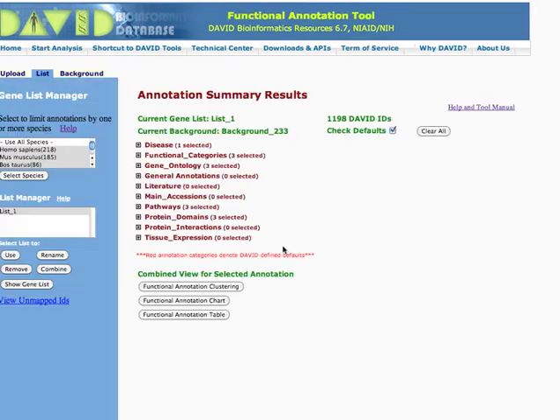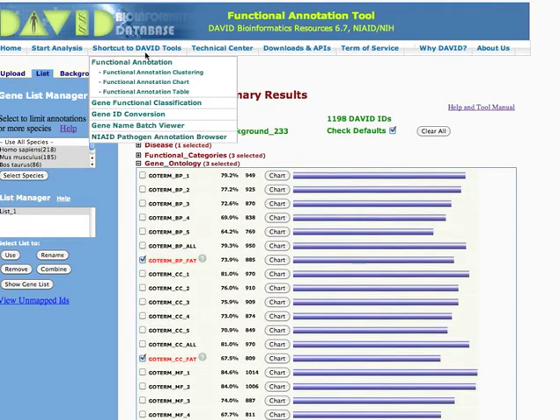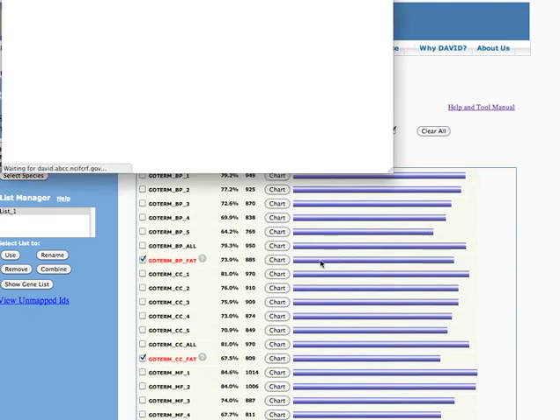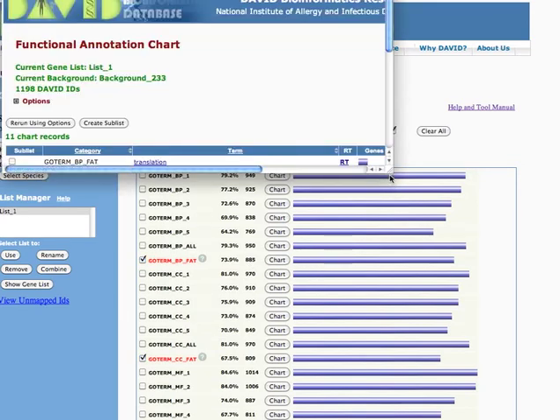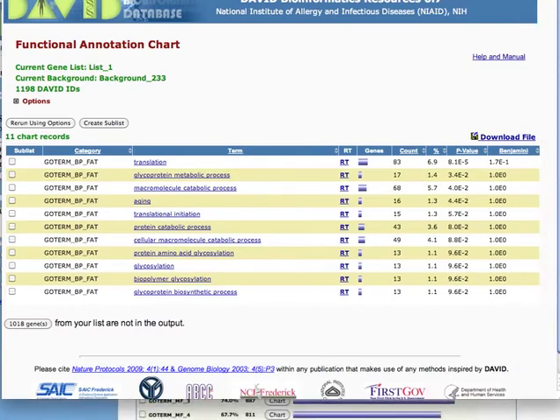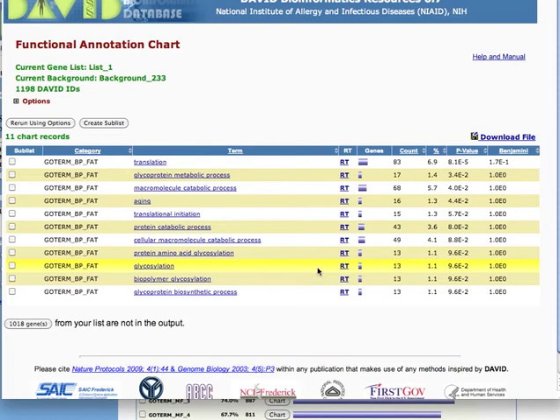So now you can do all these cool categories. So you can actually... Trans, things involved in translation, glycoprotein metabolic processes, aging. These are all GO processes that are significantly enriched. Okay?